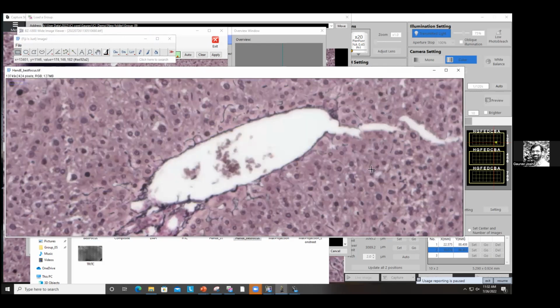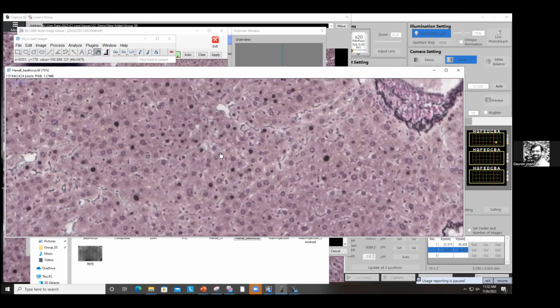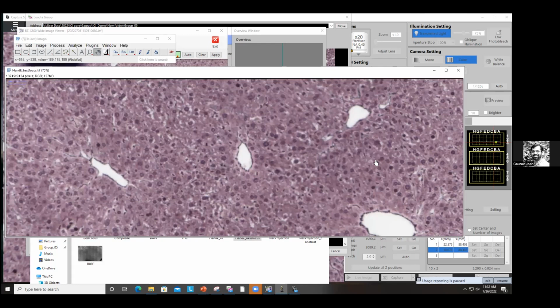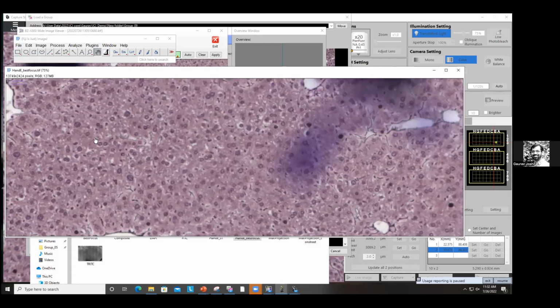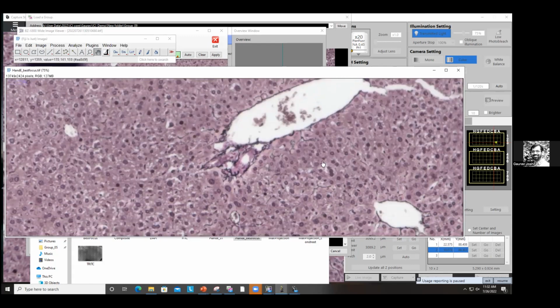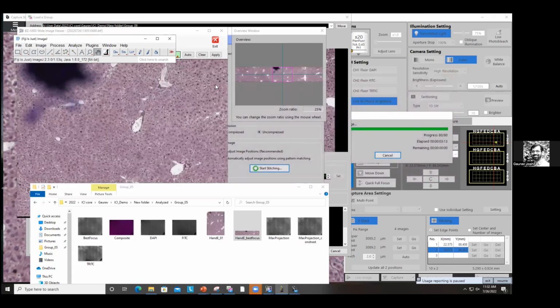Also, it's got pixelated, but this is what you want to compare from edge to edge. And edge to edge, it looks perfectly fine. There is no loss of focus from edge to edge. Okay, so that's what we are interested in. All right. So that's where the power of best focus comes into picture. And yeah, that's pretty much it. All right.